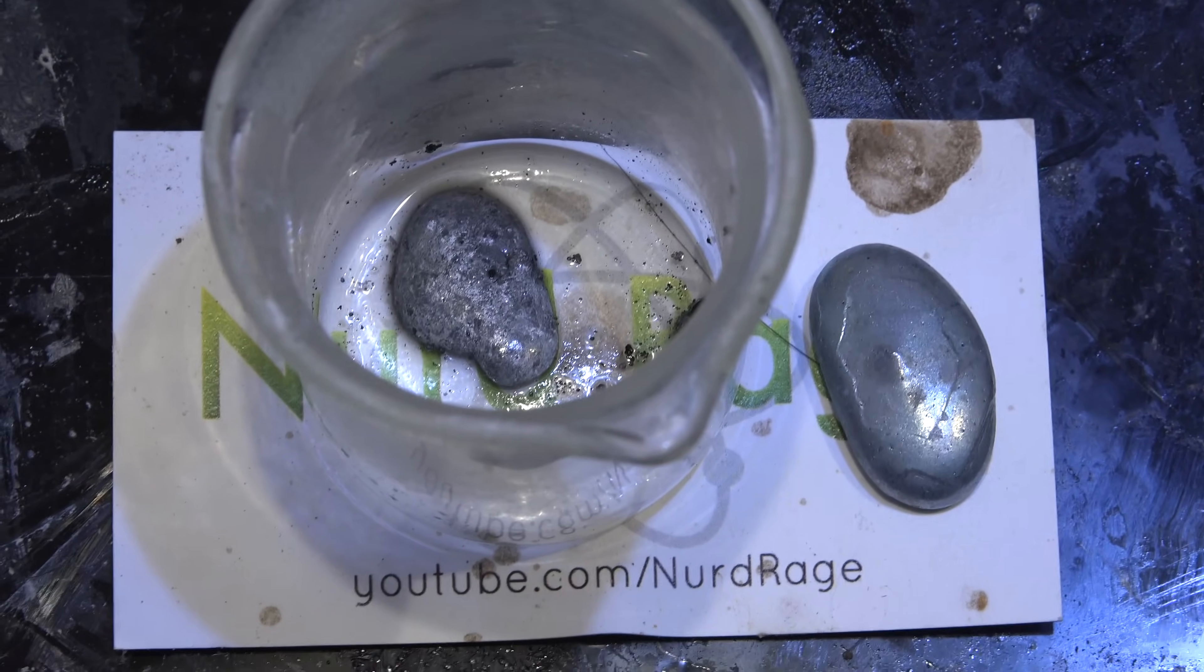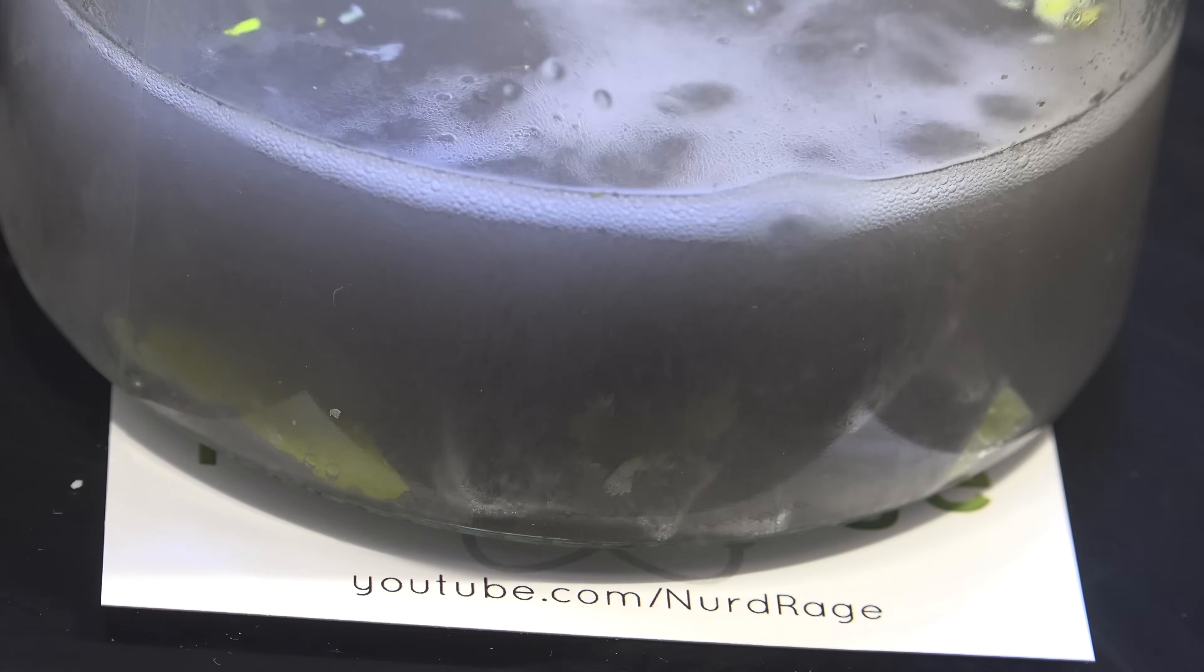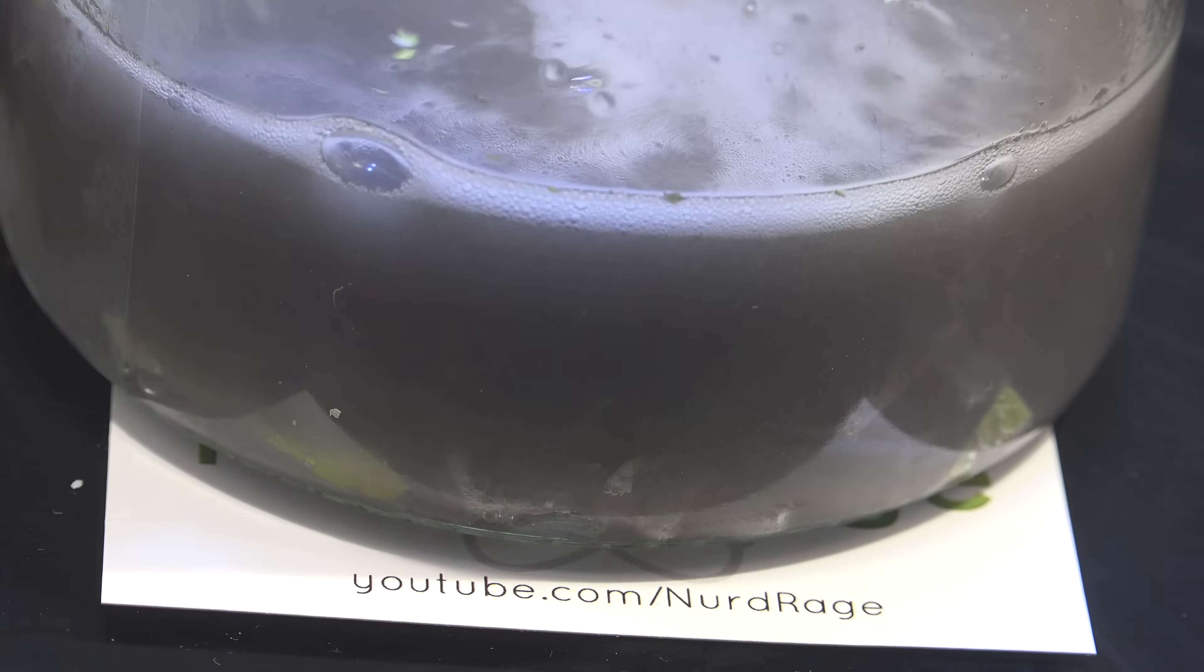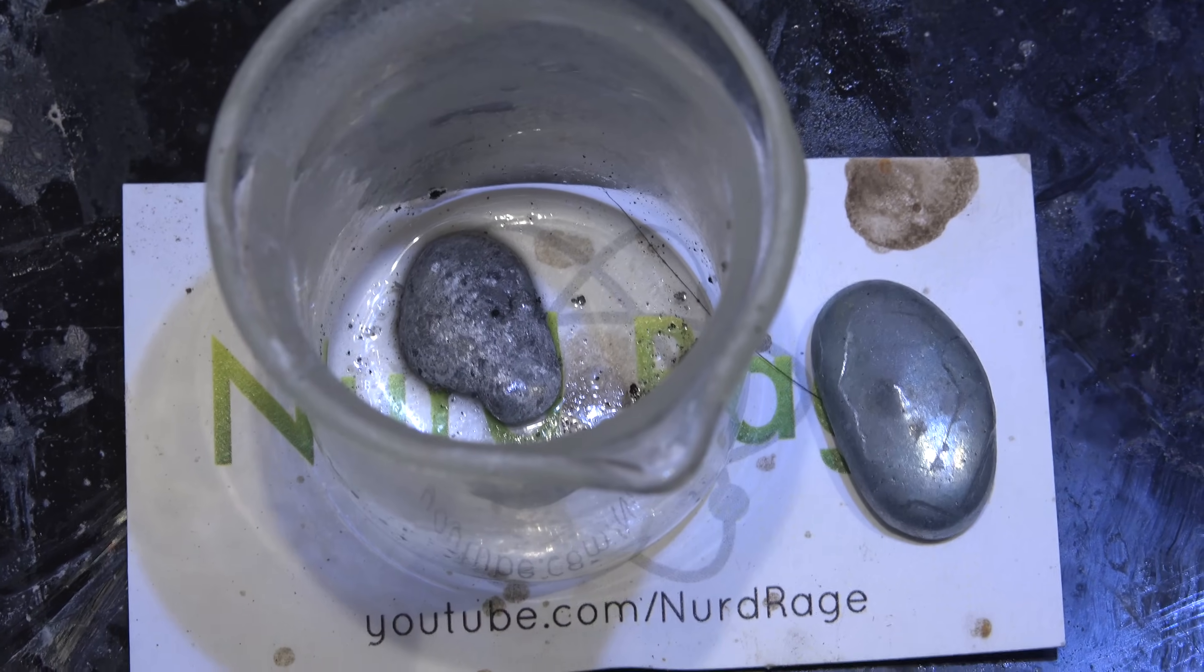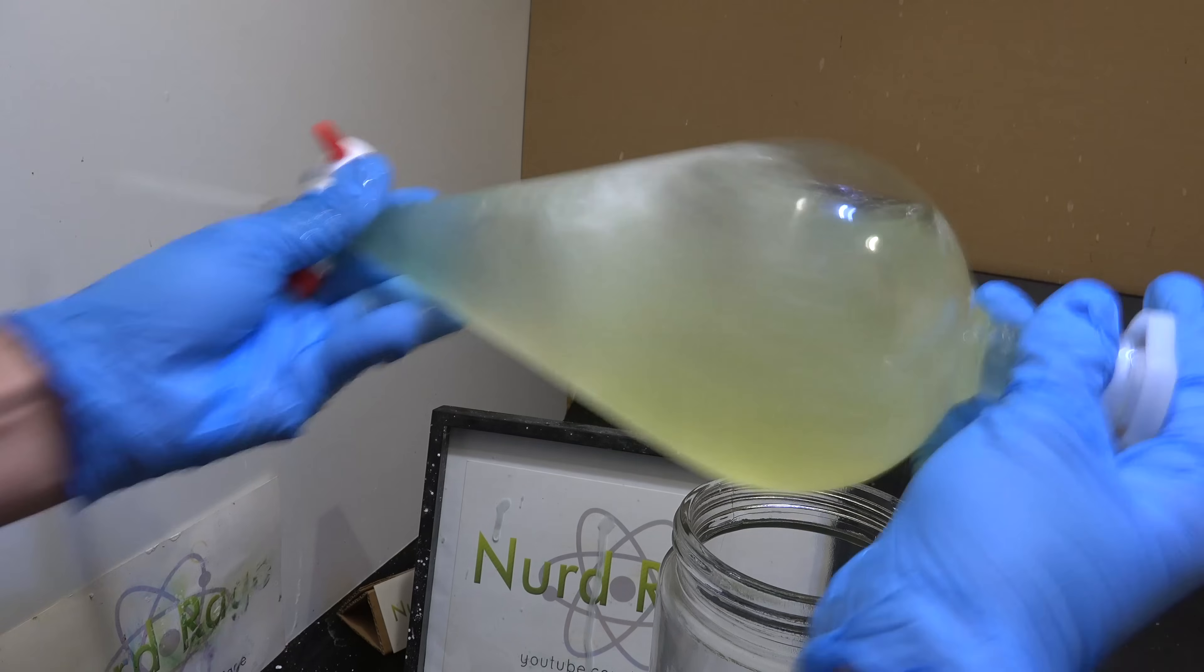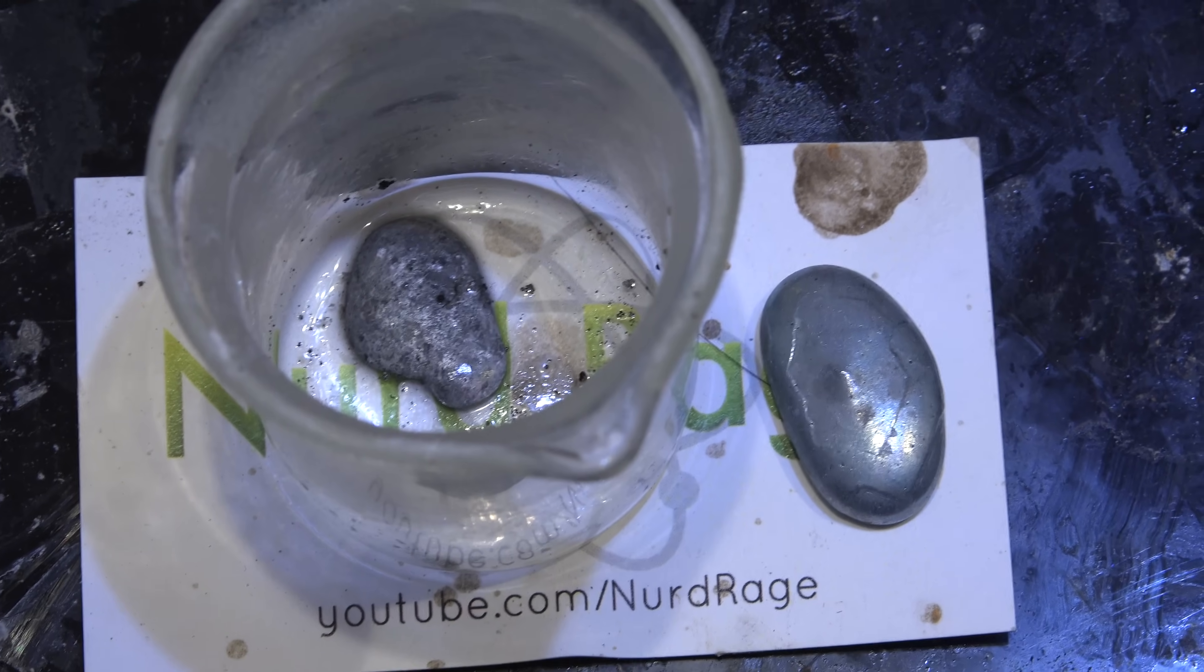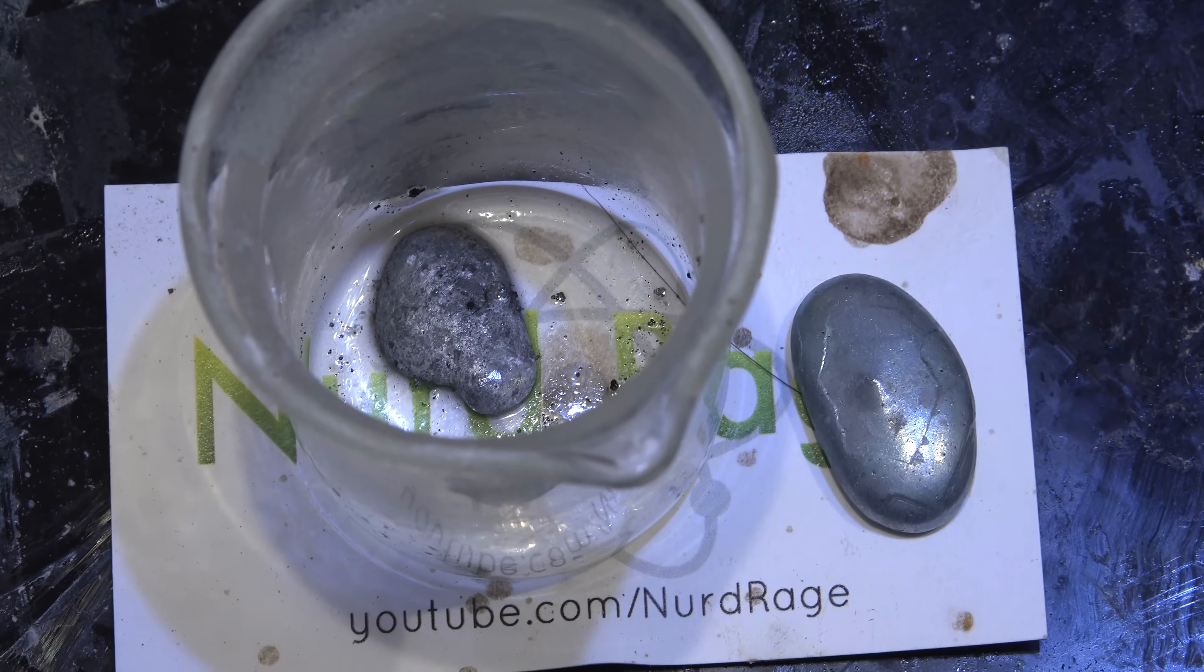So when recovering gallium you have two options. You can use the sodium hydroxide reaction as shown in the previous video which is quick and easy. But if you're willing to put in the work you can instead react your aluminum metal with hydrochloric acid and use solvent extraction with ether as shown in this video for vastly improved recovery. Assuming of course you didn't mess up like I did.